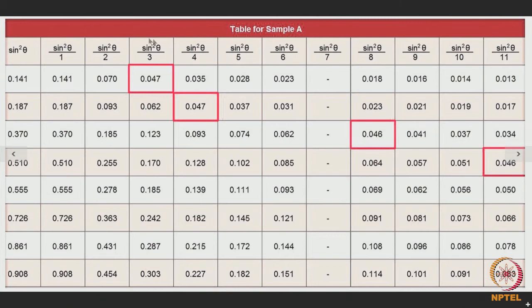This is where, for line number 2, 4 is the value of h square plus k square plus l square. So, if for line 1 h square plus k square plus l square is 3, and for line 2 it is 4, that indicates that in this particular case h, k, l will be 1, 1 and 1, and what about this? The h, k, l will be 2, 0, 0.